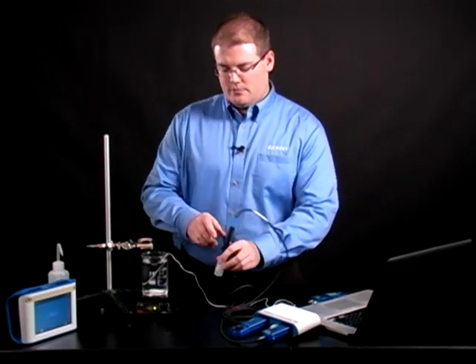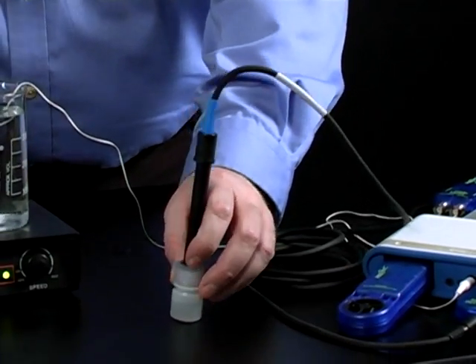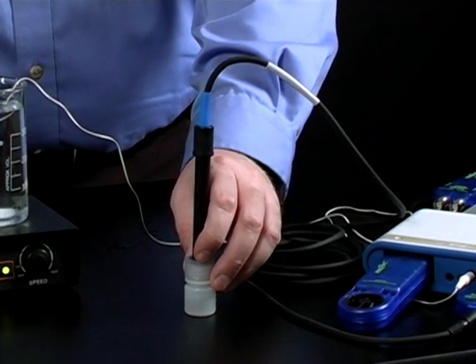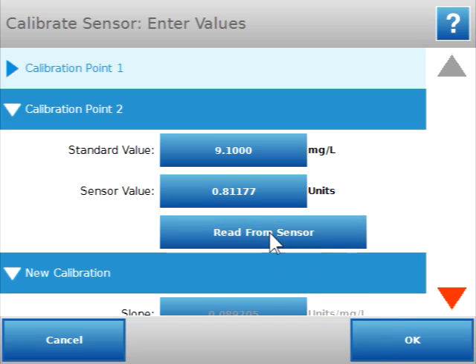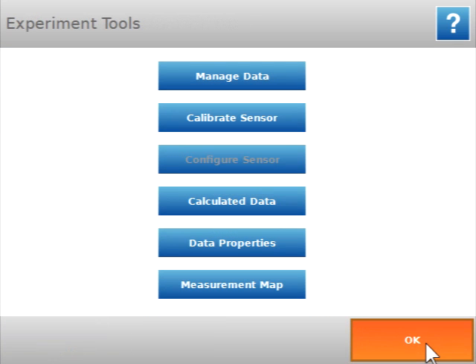After 30 seconds, place the bottle on a flat surface, and make sure there are no drops on the tip of the sensor. Then press read from sensor. Then click OK to return to your experiment.